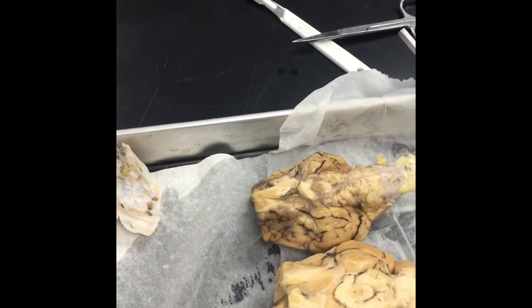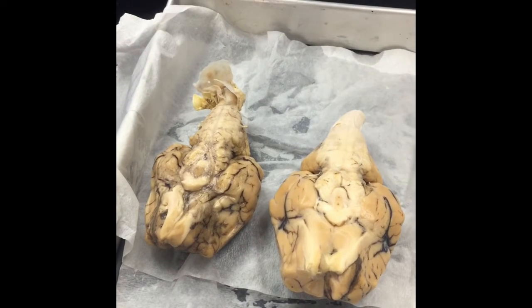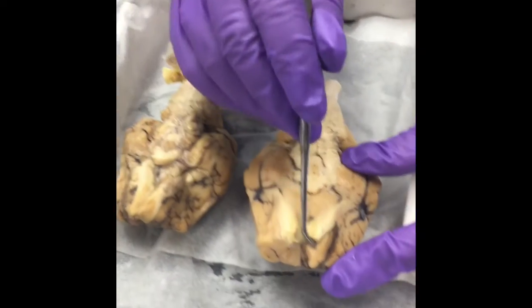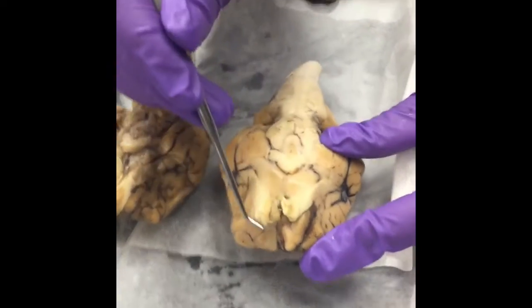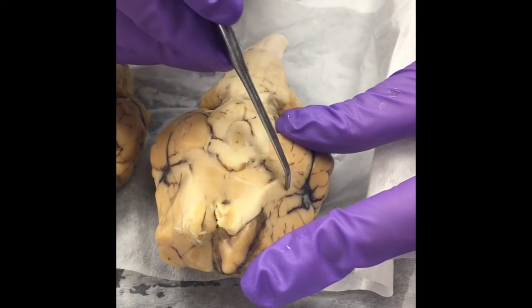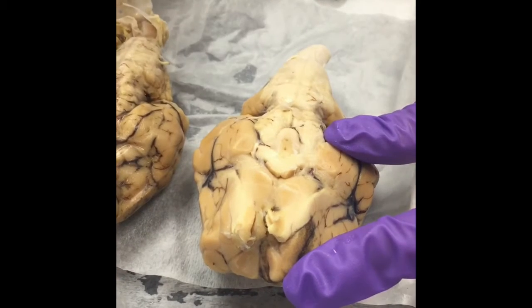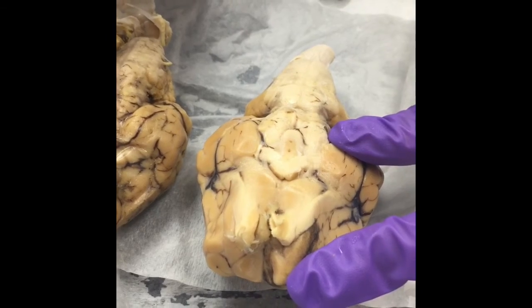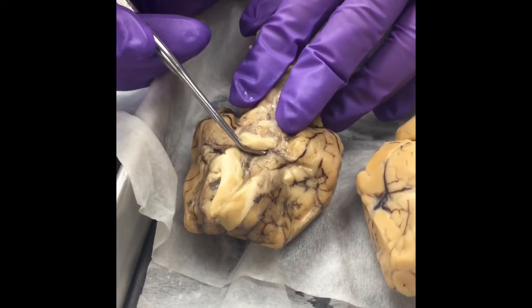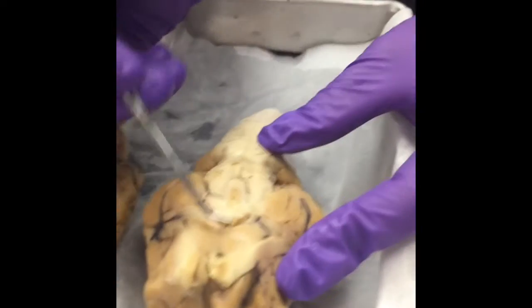By me? Yep. Okay, so now on the underside of the brain, we could see some of the cranial nerves, which are any of the nerves that extend from the brain. So up here, underneath the frontal lobe, here and here, these are olfactory bulbs, which extend to the olfactory nerves. That's cranial nerve number 1. Unfortunately, we cannot see cranial nerve number 2 very well here because they've been cut. They're attached to the back of each eye, so they are probably with whatever eyes these brains went to. But you could see where they were cut from.